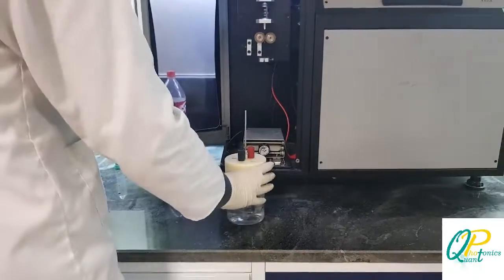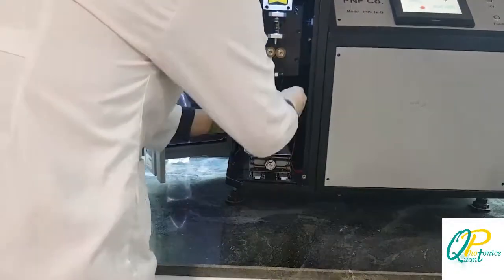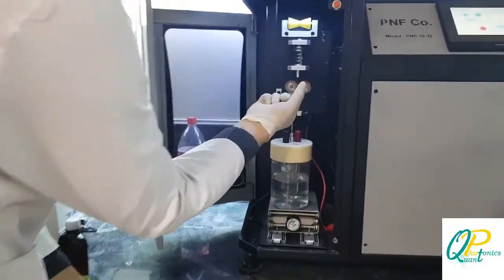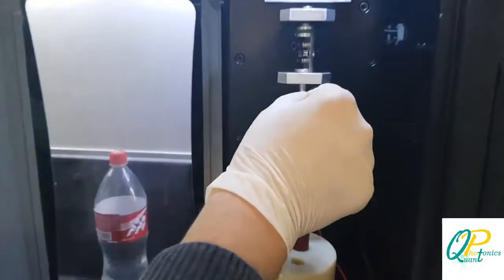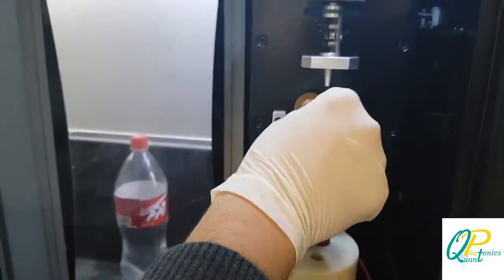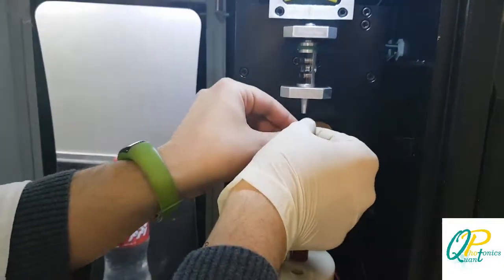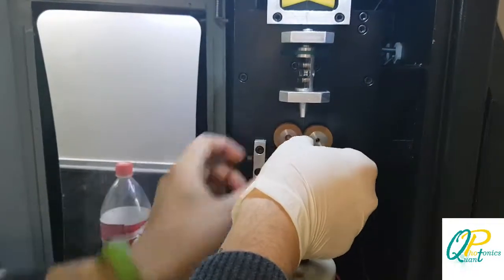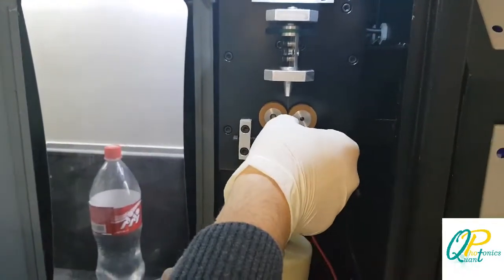We put the container in the device, and as you can see, a silver wire has to go down and dip into the water. I pulled the wire and put it into the container in this special rod.